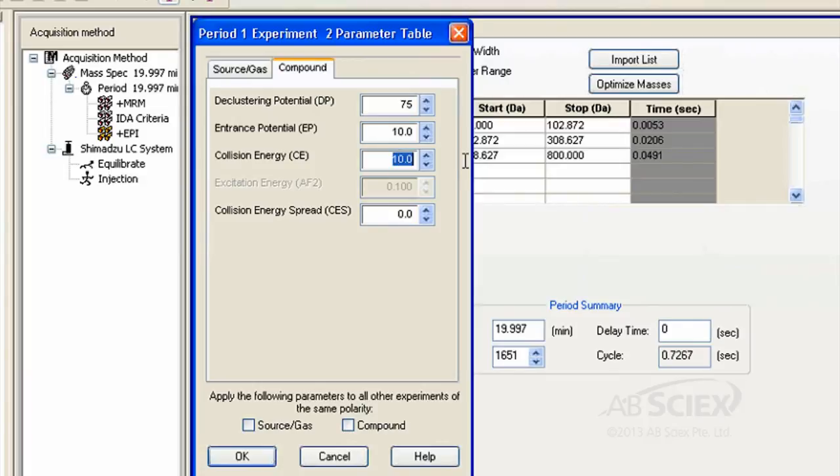We recommend the collision energy of 35 volts with an energy spread of 15 volts. This just means that three different collision energies will be used for fragmentation to give a more comprehensive MS-MS spectrum.